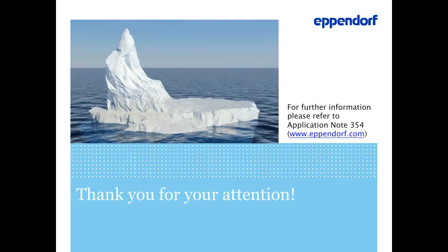Great, thank you. And then if tips have such great influence on pipetting results, why don't you sell a closed system? Wow, this is an interesting question. Thanks for that. We want to give the customer all possibilities. So not all tips on the market are poor or not suitable. So there are good tips on the market without any discussion. However, if you decide for other tips, it is up to you to make sure that the system performs well. And you can do this by checking the tips and calibrate the system.